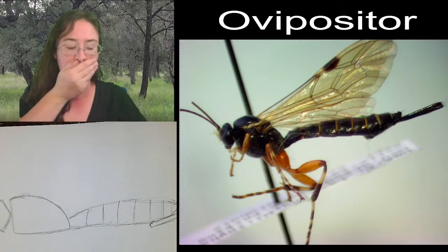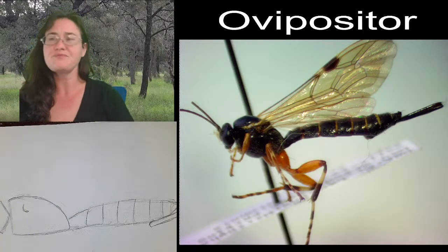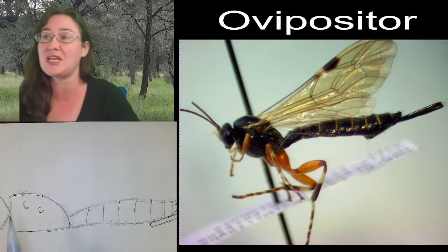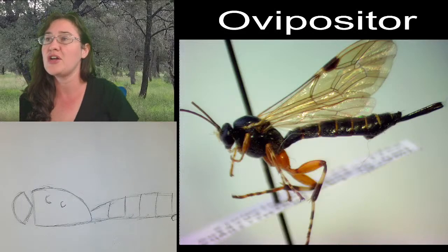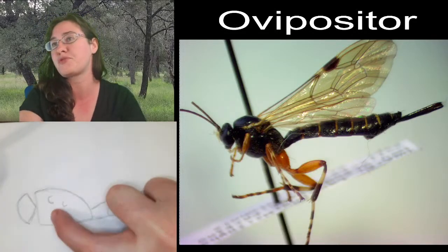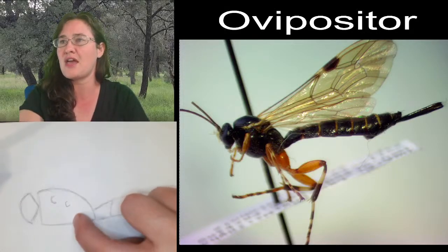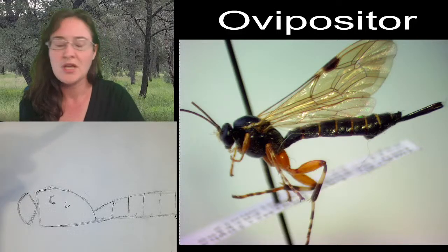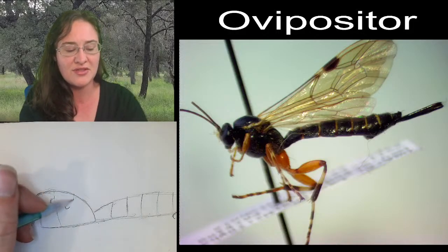Now, our defining characteristic for ichneumonid wasps is on its wings. So let's see. The wings are going to start, you can imagine them starting at the end of the pronotum and the end of the mesonotum. The end of the first segment on the thorax and the second segment.